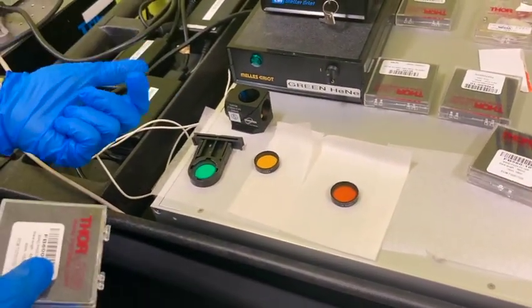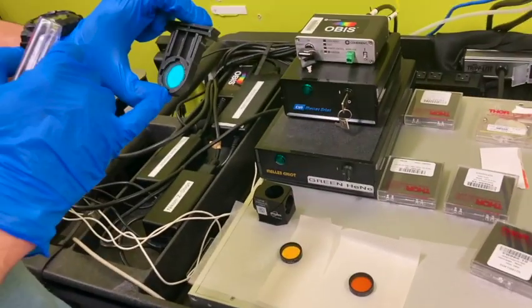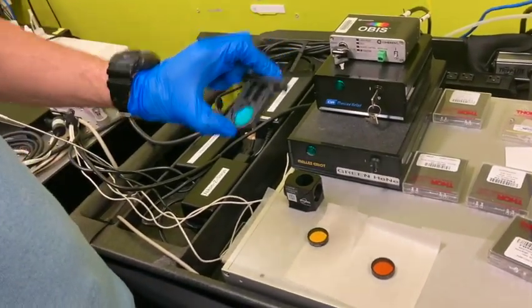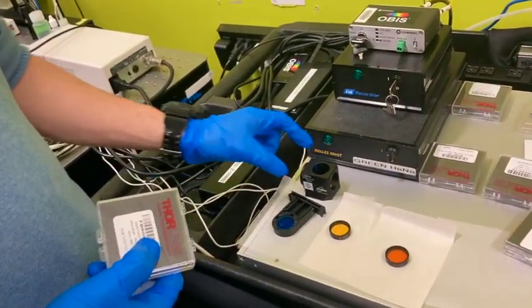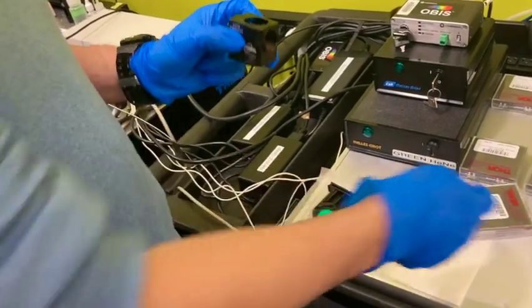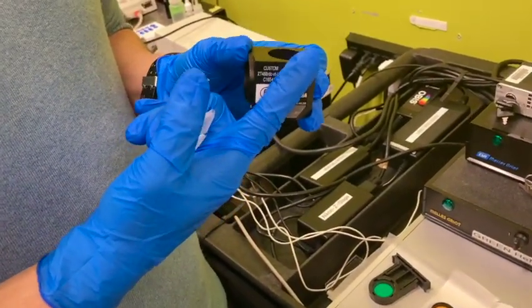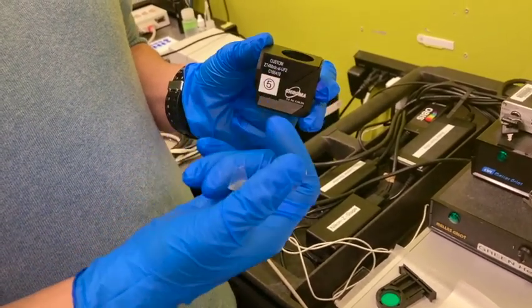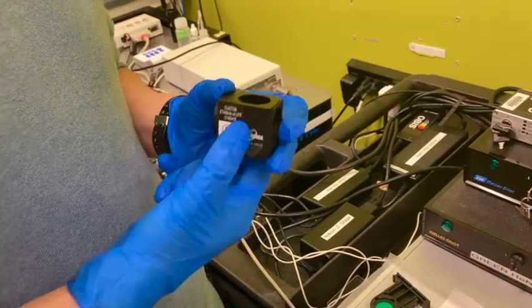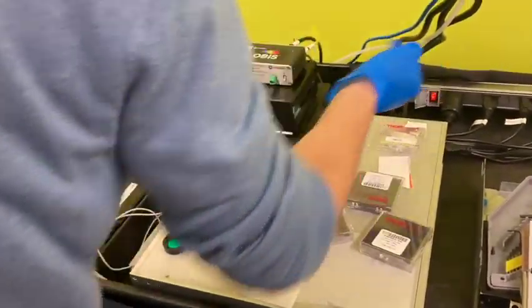So what we are seeing is the refraction from the bottle. Like this blue filter, the blue line will come through, and we have this yellow come through. So basically that's the filter. And we also have a dichroic. This is a mirror. So this also separates by the wavelength. I don't know if I can find a better way to do this, but let's try now.